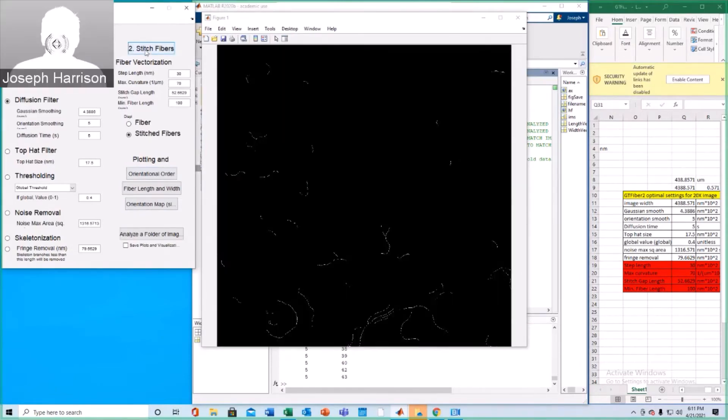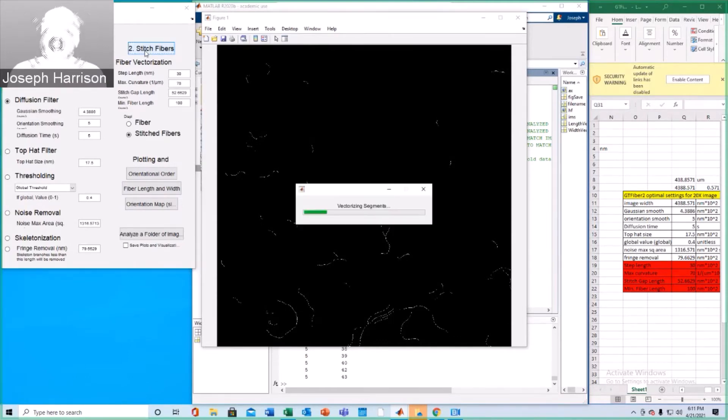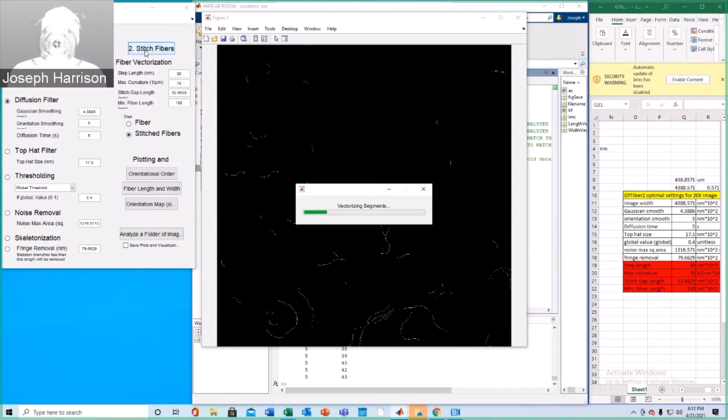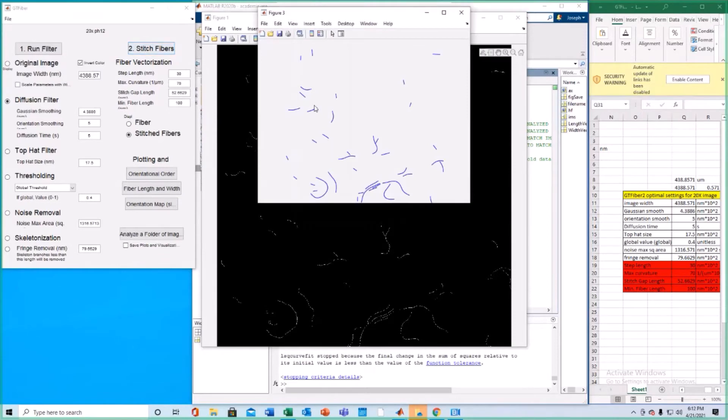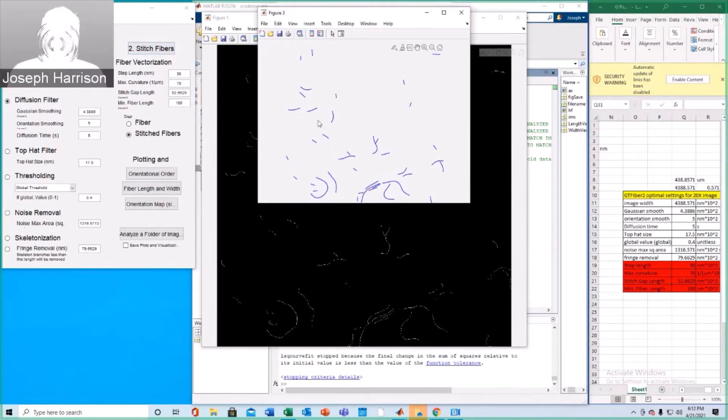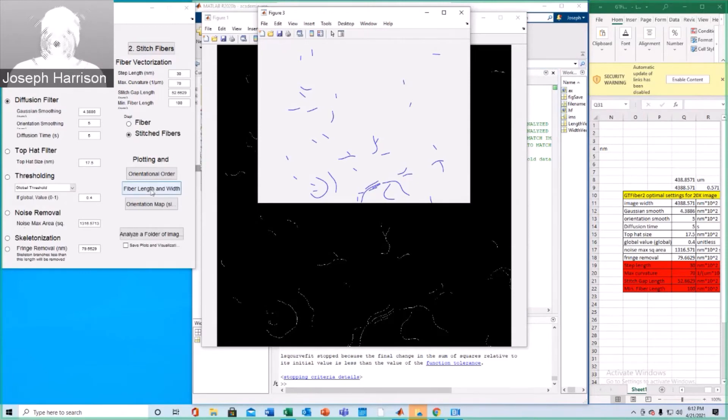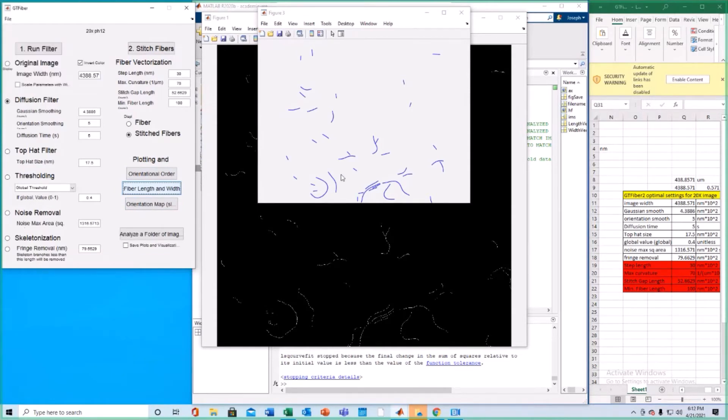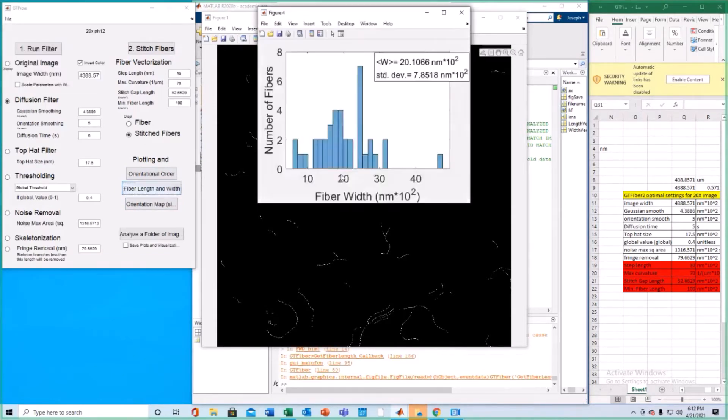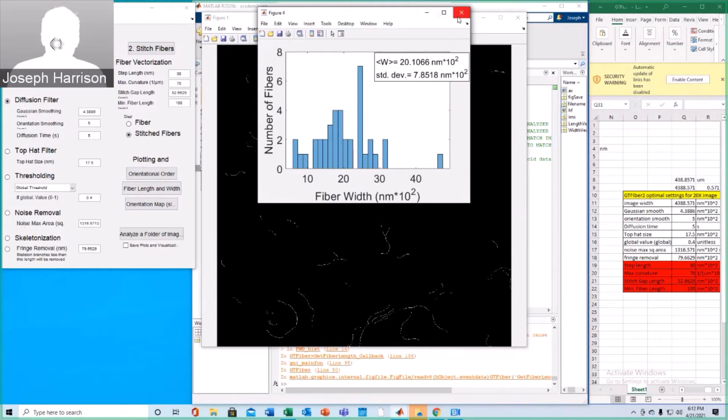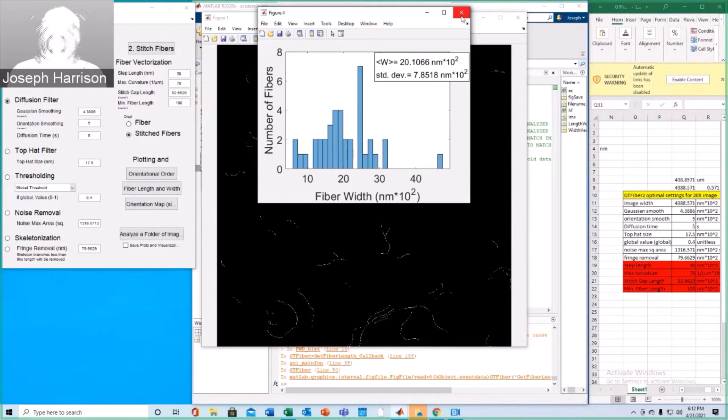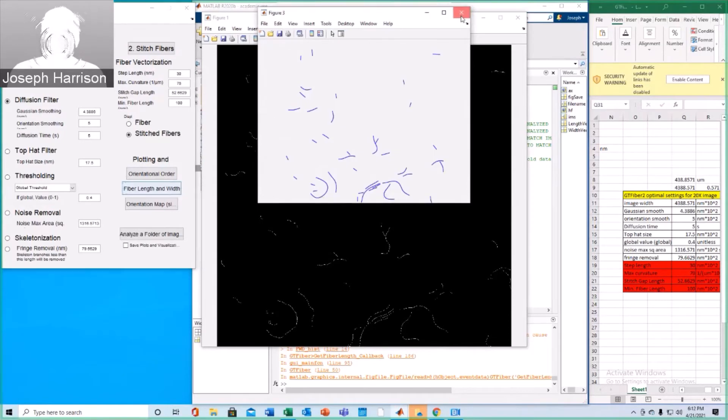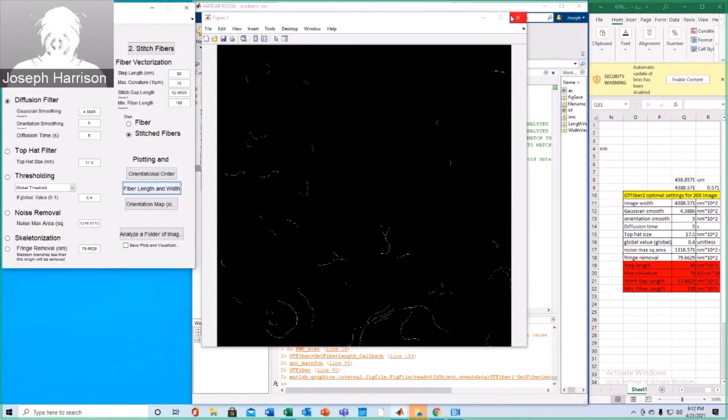Alright, there's the resulting skeletonization. Now we're going to stitch these fibers. Alright, here are the resulting vectorized fibers. Now we're going to run the fiber length and width option under the plotting section. Alright, and then that previous structure that we had was just overwritten, and we can extract the new length and width vectors upon renaming them within the MATLAB code. Go ahead and close out of all of these.